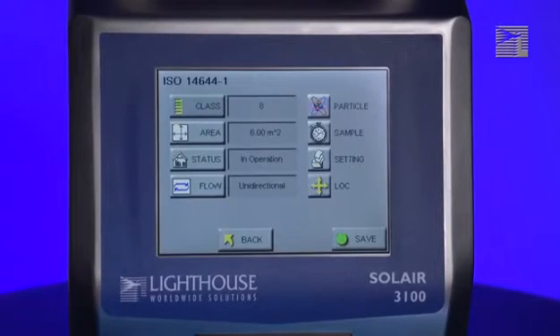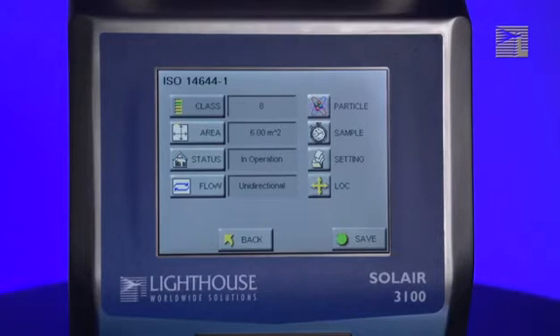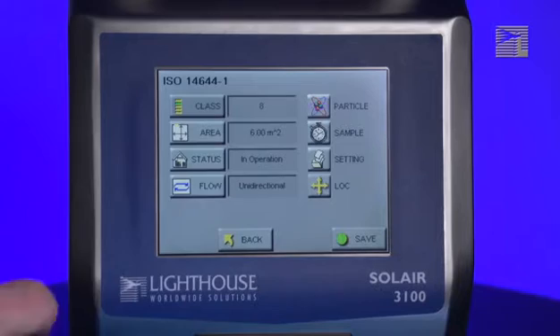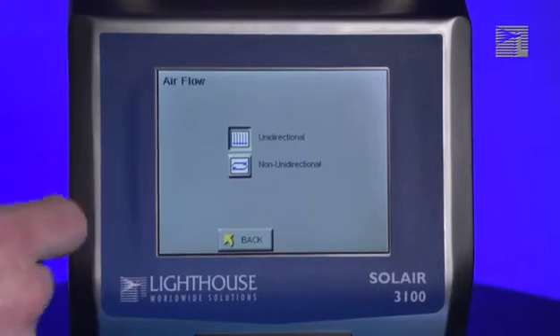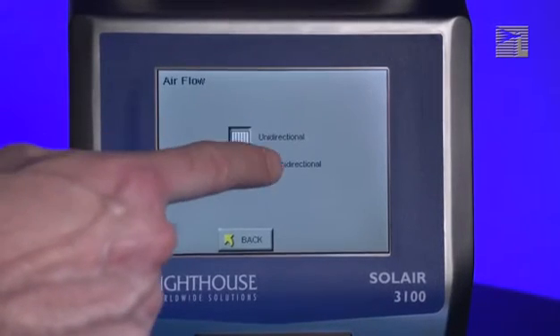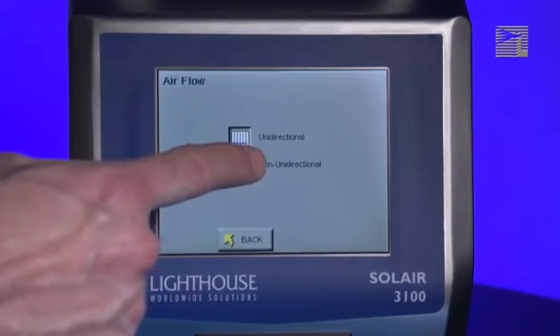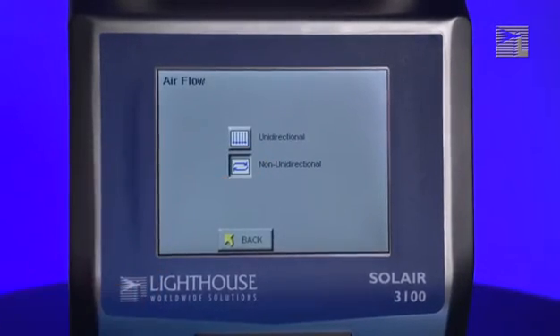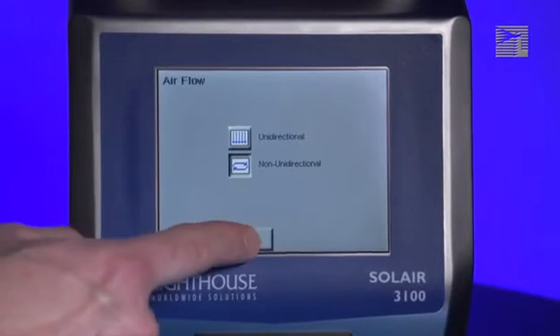When you are taking samples to classify the room, you must specify whether the airflow in the room is unidirectional or non-unidirectional. To set the type of airflow, press the Flow button. Select either unidirectional or non-unidirectional flow. When you are finished, press the Back button.